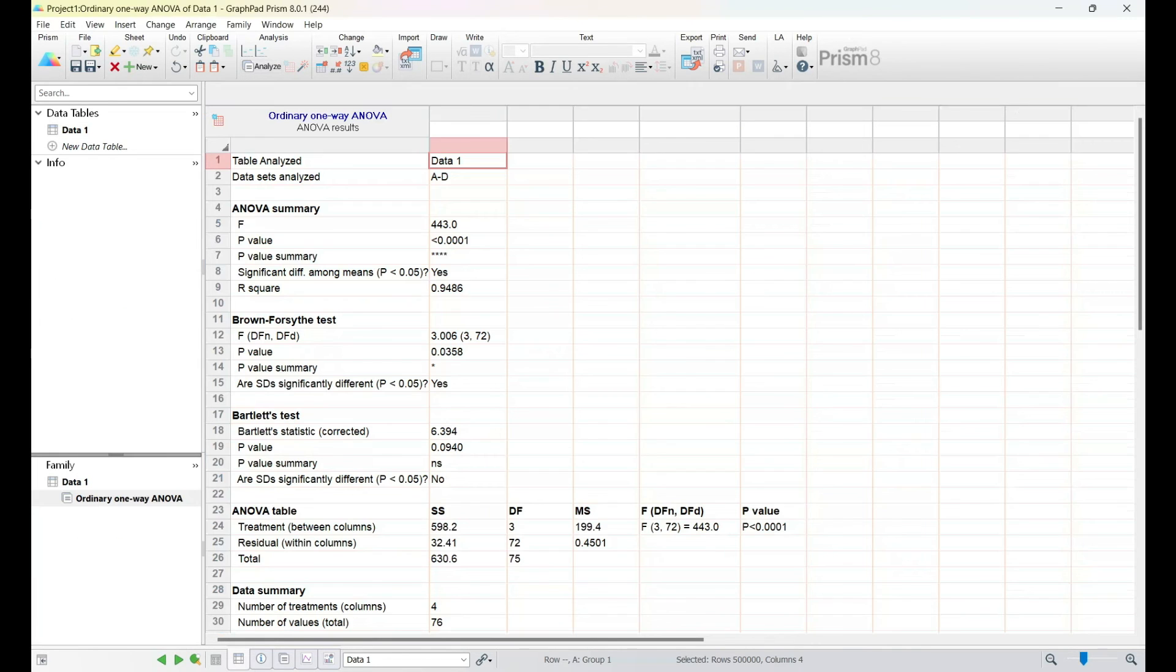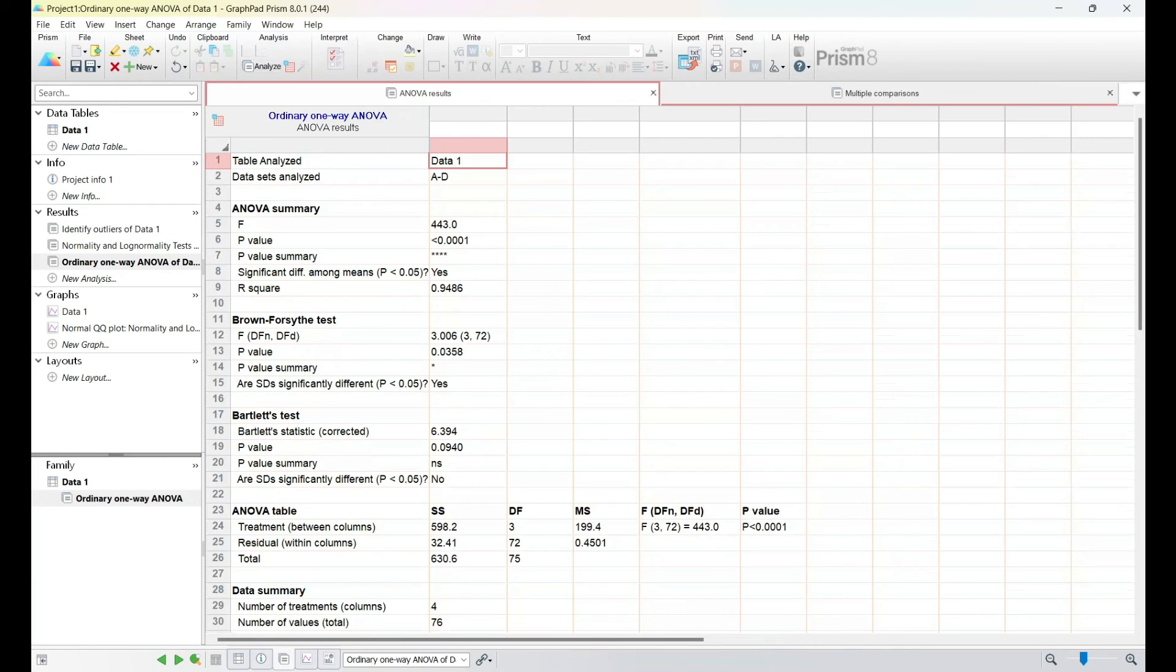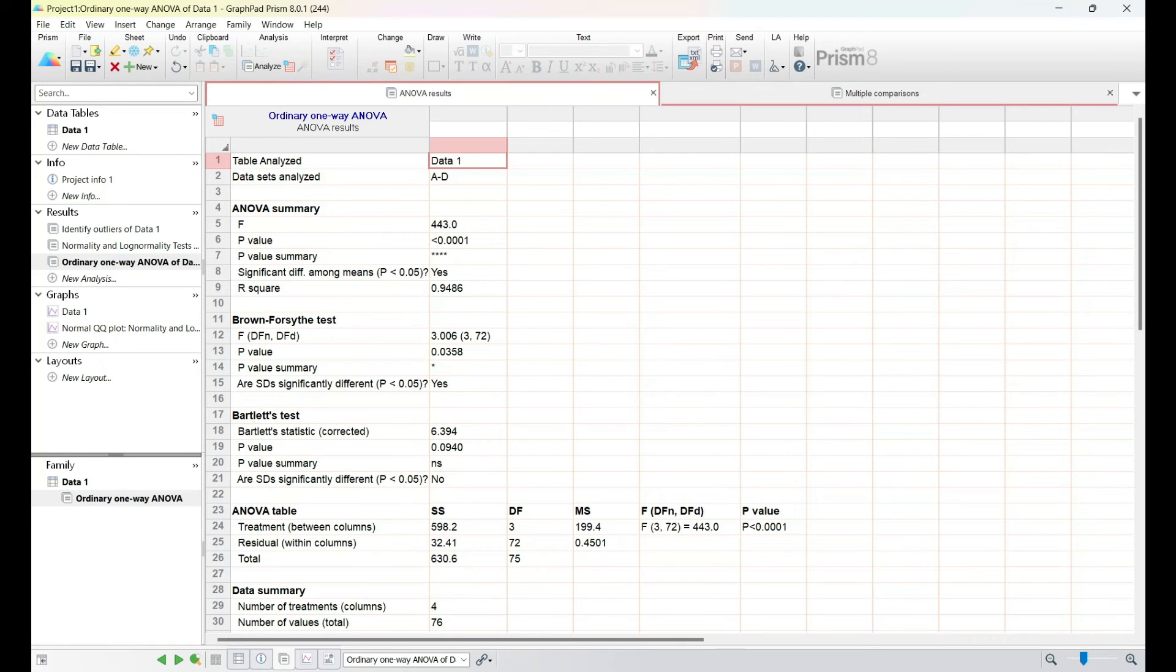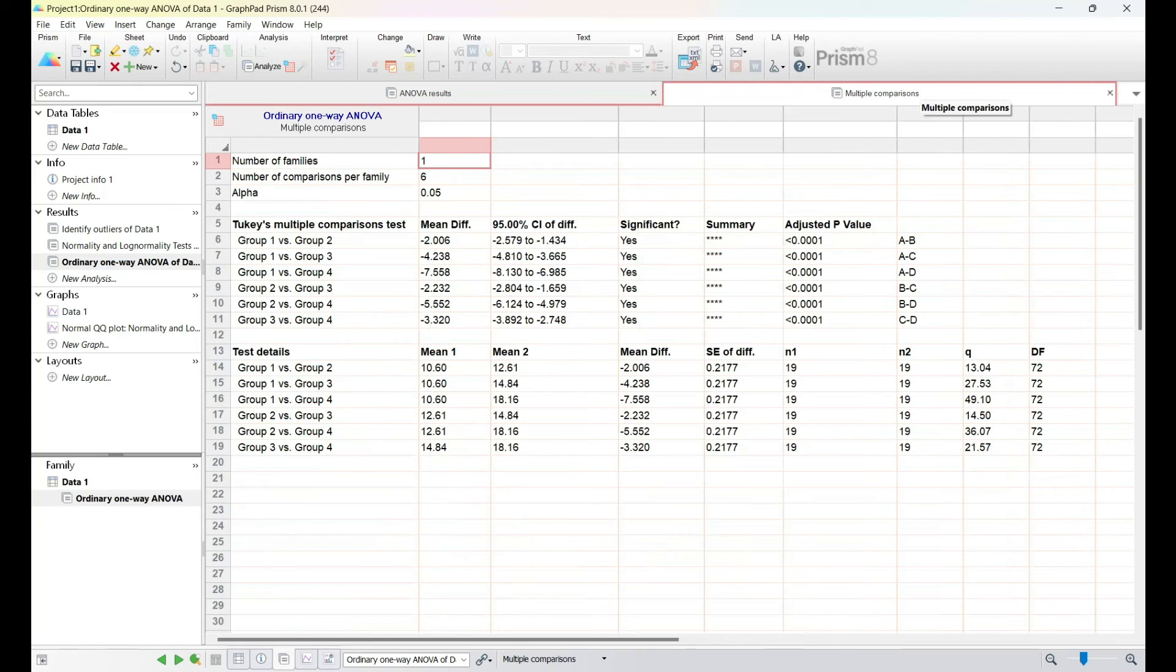We'll discuss post-hoc tests, multiple comparisons, and the significance of p-values. GraphPad Prism offers valuable tools for exploring the nuances of your data, ensuring a comprehensive understanding of the statistical landscape.